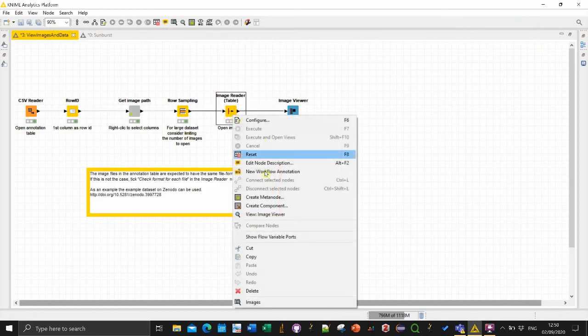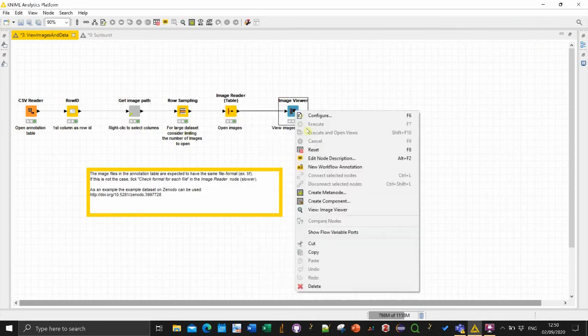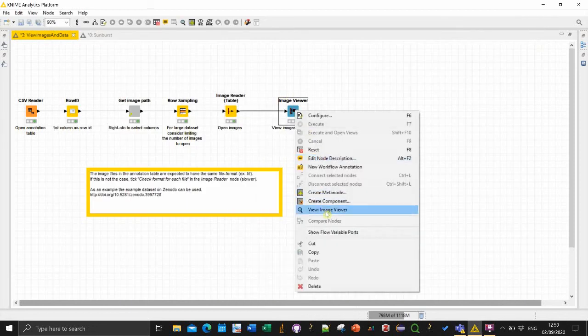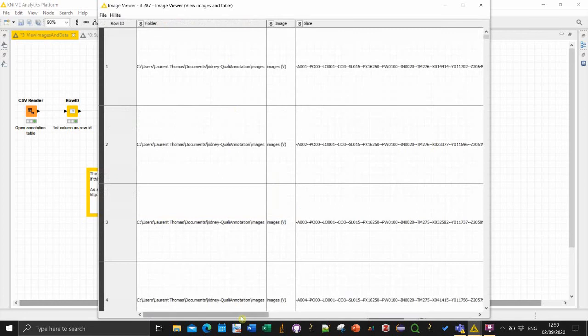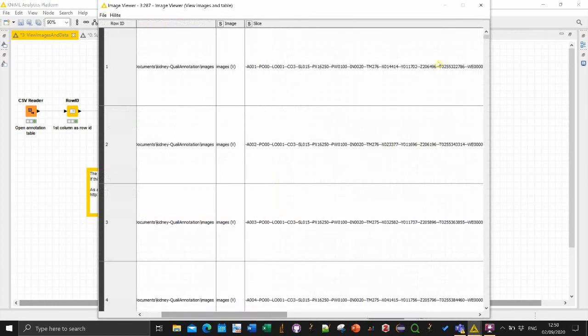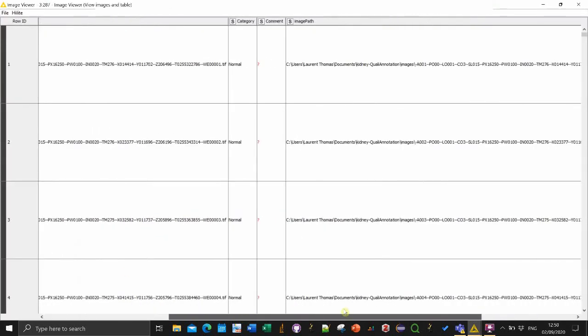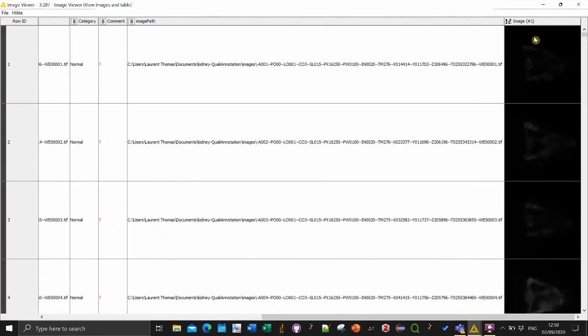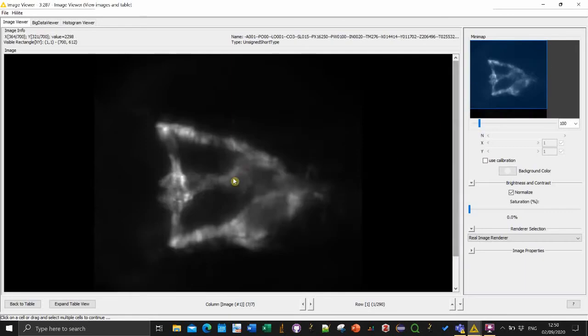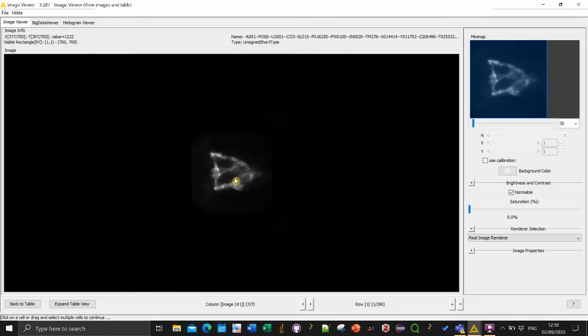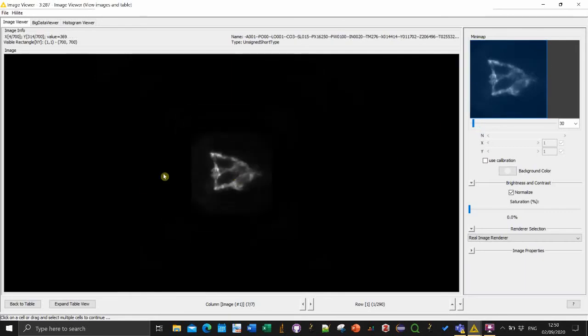When we're merging the directory in the file name you see this image pass column appeared and you can check it if it's correct. In my case it is. And then if you now go here view image viewer then you have a view of the table.